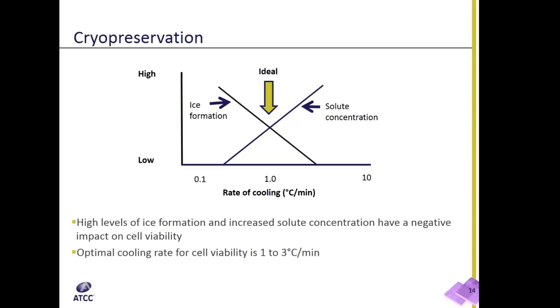I want to first go over the basic theory behind cryopreservation and how it works. The freezing process is a complex phenomenon that has been studied for decades. Since water is the most important component in living cells, cellular metabolism stops when all water is turned to ice. This freezing process, however, is largely detrimental to the cell's health.